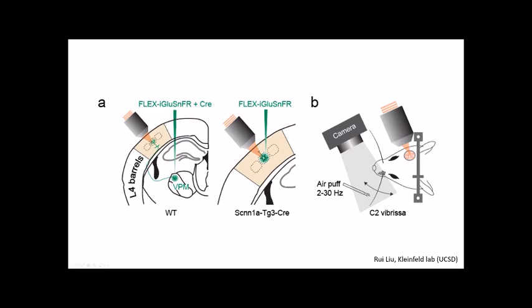And then he also labeled layer 4 neurons in the barrel cortex that receive that input as well as a lot of recurrent input. He's then going to compare what the patterns of activity are of the feed forward inputs versus basically all the input that comes onto the dendrites of layer 4 neurons, both feed forward and recurrent, where the vast majority is recurrent. He does this in awake mice, where he's stimulating the whisker at some known rate. And this is all done very deep in cortex for imaging methods, about 400 microns.